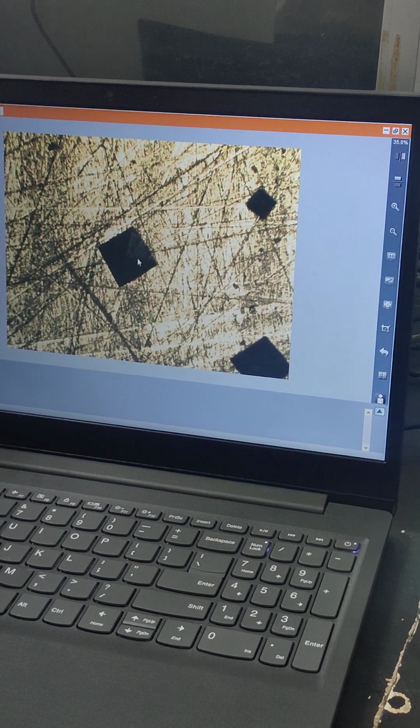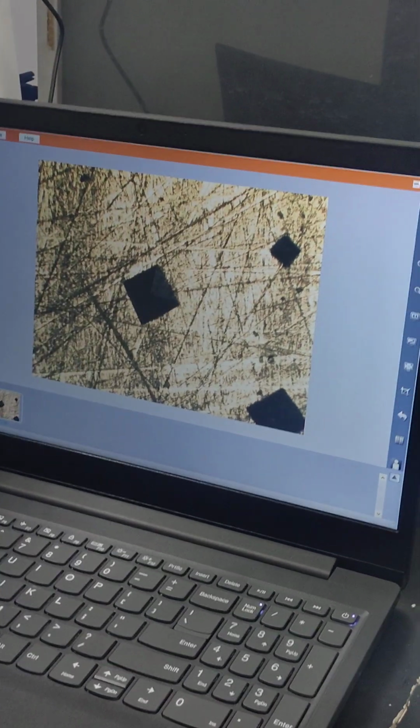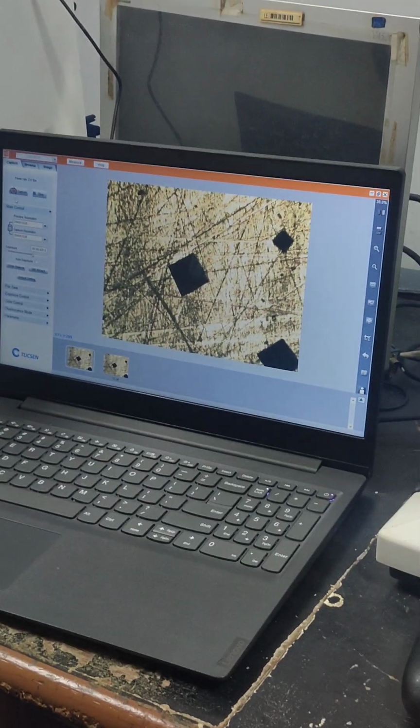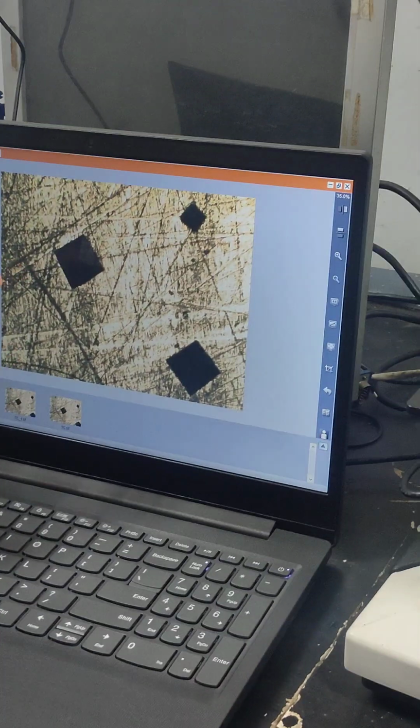Now let's put it back to the application. We can capture it again, or we can move on, depending on how many indentations you had. But we wouldn't want to have too many, to damage the material. Let's take pictures. Put it back to the center.